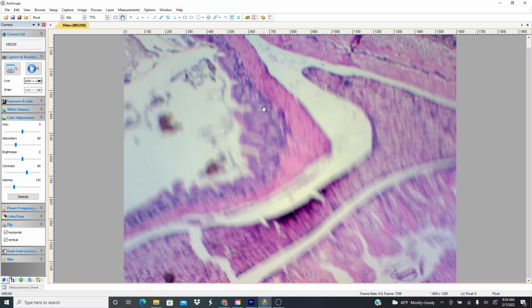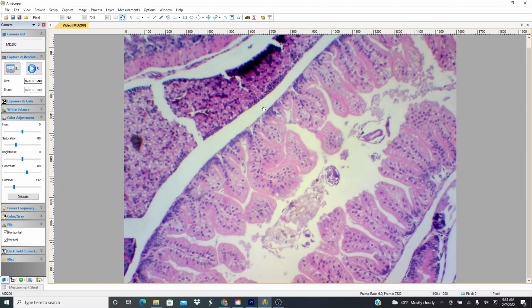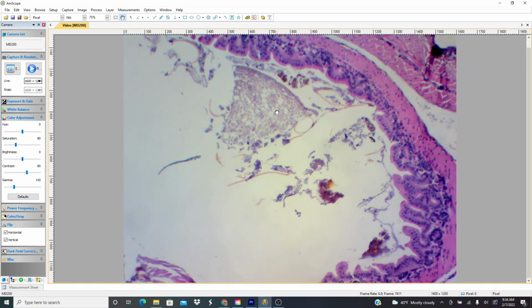Let's look and see what's on the outside here. See, here's more. So you can see the gut changes. Here, it's got what look like villi, what we would call those in the small intestine of humans. So I wonder if this, oh, this can't go in lower power. I wonder if this is more like the stomach.